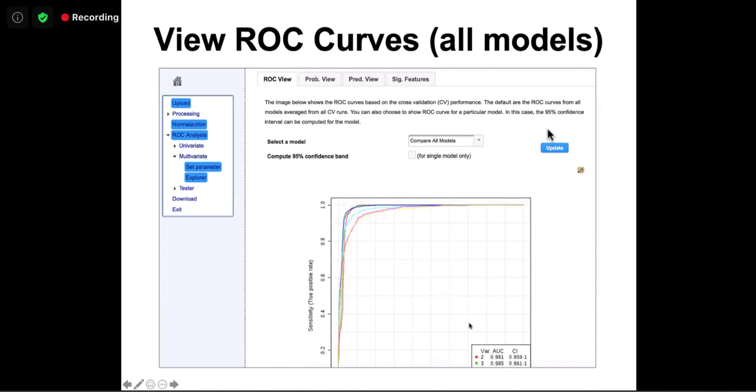The bottom part is already cut off. But just below, you can see there's some ranking of the models, 2, 3, 5 or different sizes. The top performing model is not necessarily the one with the most features. So 2 or 3 probably give you the best. Cross-validation does tell you that using 100 features actually is not working well.